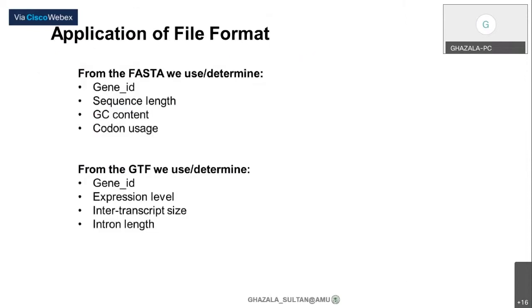Before starting any kind of study, we go through the basics of it, and the basics start with the file format itself. Here it is given what we can get from the different file formats, why it is important to know about file formats, and to understand the information within them. That is just given as an overview of the applications.